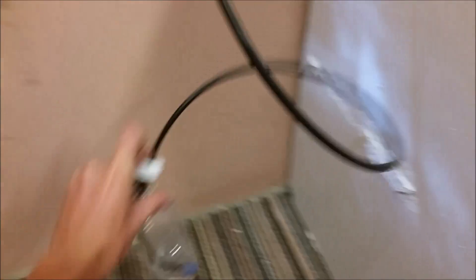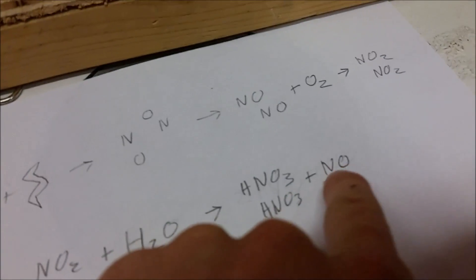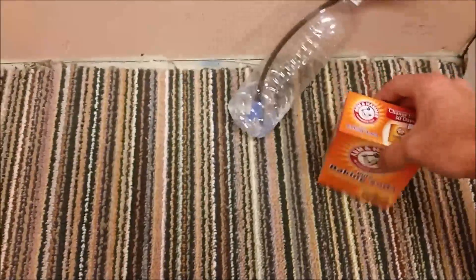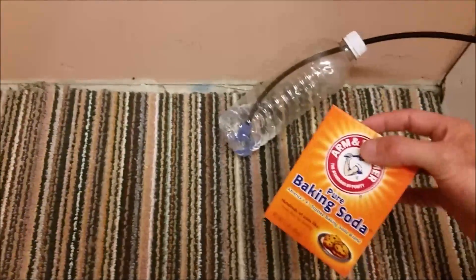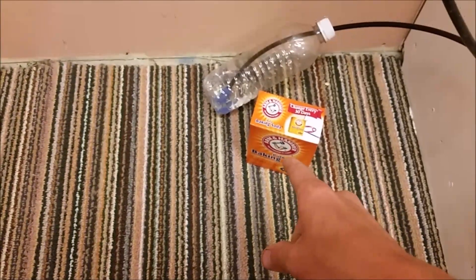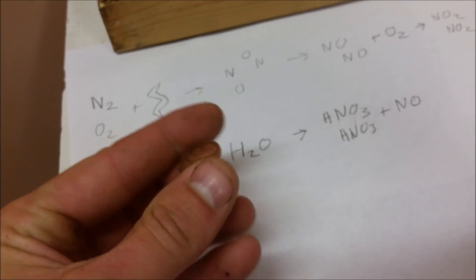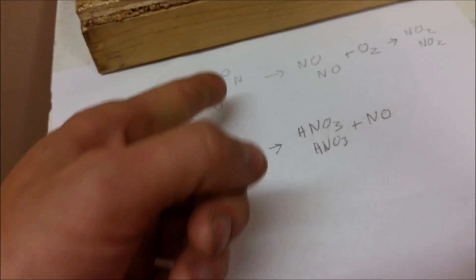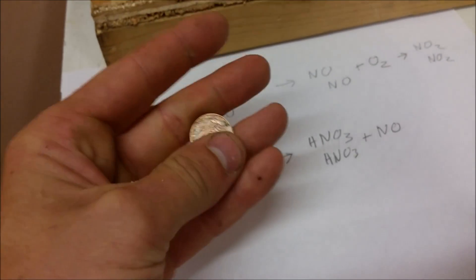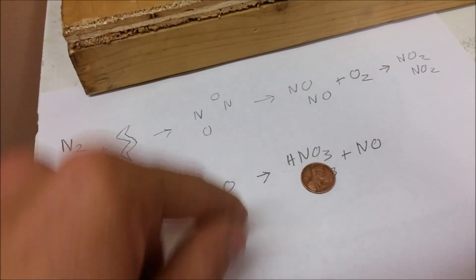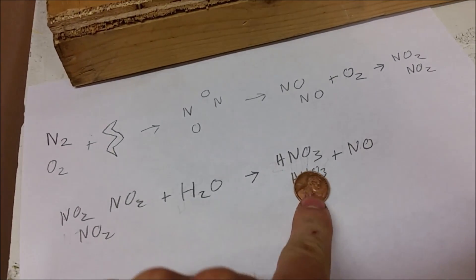The process won't be a hundred percent efficient because of course this nitrogen monoxide species escapes, but it should be enough that I'll be able to tell if it works at all. If I am able to make nitric acid, I should be able to tell by adding some baking soda to the water. If nitric acid is present, it will react with the sodium bicarbonate forming sodium nitrate and CO2, which will bubble out of solution as my indicator. Also, just in case the water is acidified without forming nitric acid — say maybe this makes ozone or some weird acid — I'm going to add this penny to the solution as well. If the penny dissolves, I'll know it is in fact nitric acid, because nitric acid is one of the very few acids that can dissolve copper.